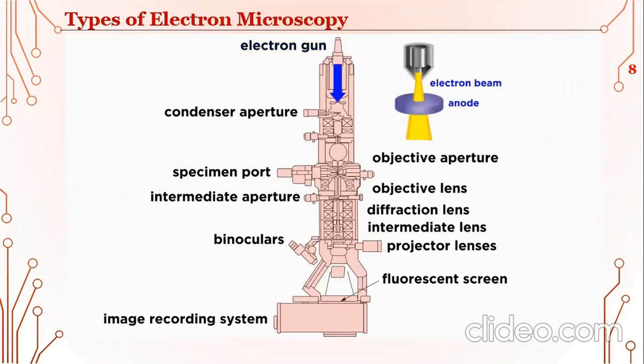The electron beam is accelerated down the column of the microscope after passing through the anode. The electron beam then passes through the specimen, once again losing energy as electrons pass through electron-dense regions. The electrons then pass through the objective lens, magnifying the image, before the electrons pass through the projector, or ocular lens, which magnifies the image further and projects it onto the fluorescent screen.